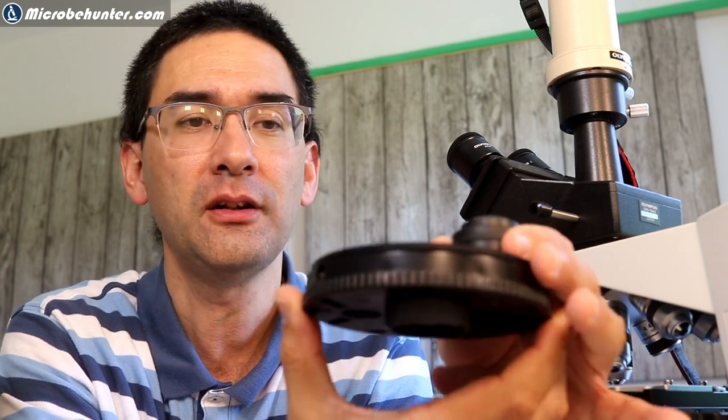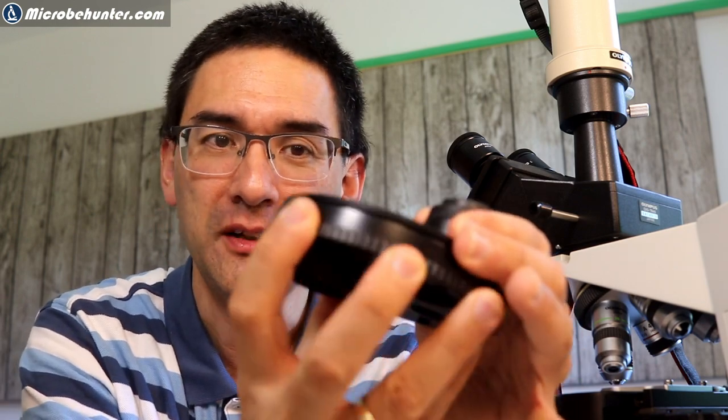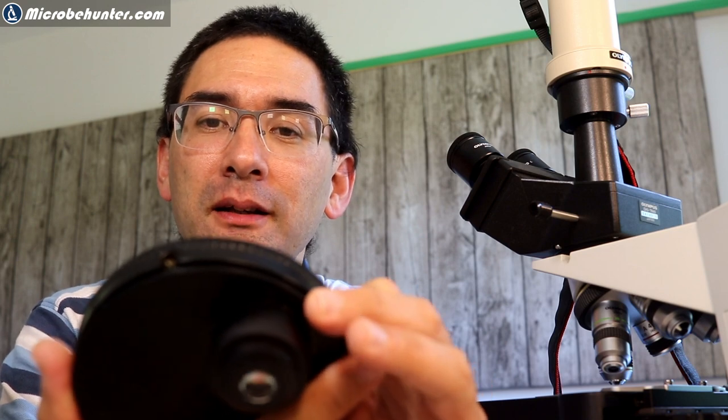Basically what you have to do is you have to rotate this bottom part here and then you're able to view the image in phase contrast or in bright field or in dark field. So it's actually very convenient. I don't have to take off the filter holder of the condenser to put a filter in there. I simply can rotate the turret here and it's going to work. Very convenient. I'm very happy with the results.